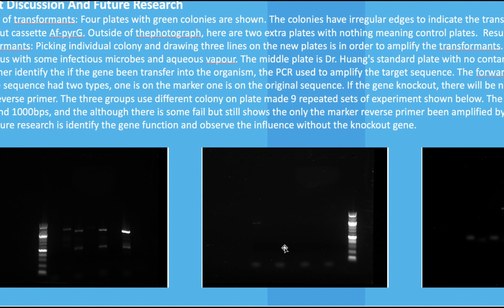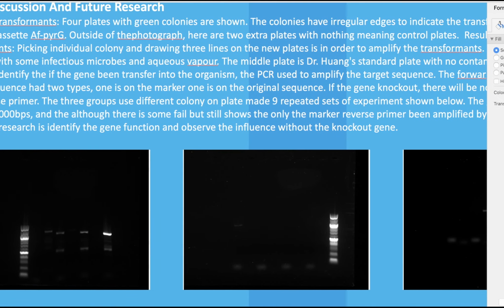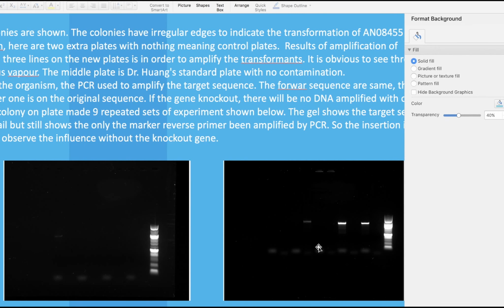In our group, they are all negative, and we only have the control group, so there is some big mistake here. In group 12, two of them succeeded, and the last one didn't work, so there is some failure rate.